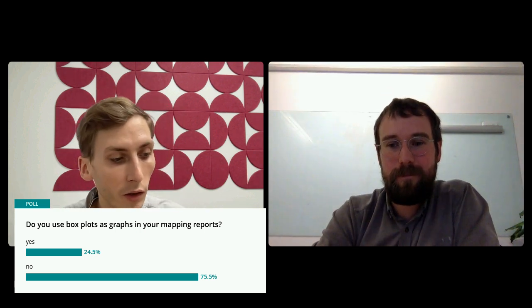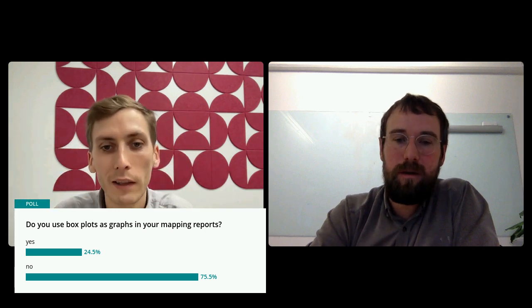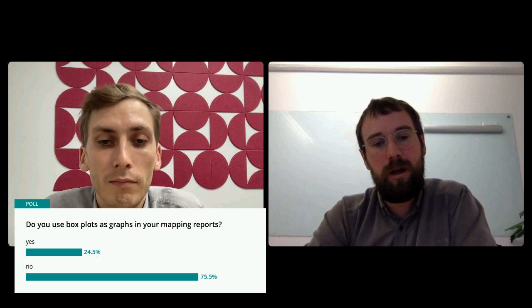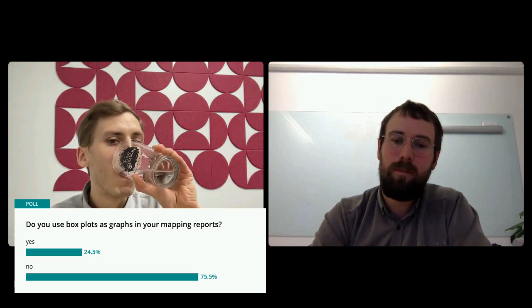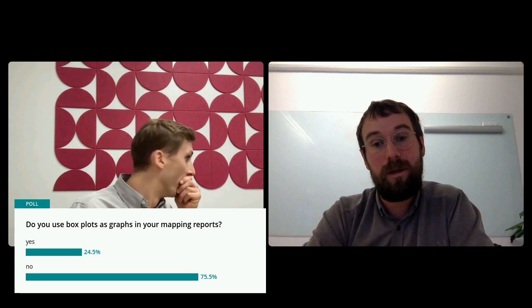Yeah, and something else, when you opt for using software applications from GxP, it's part of the suite that we can visualize. Absolutely, that's also the reason why we've implemented it in our software. It's just such a powerful tool to view data, rather than what I find often is a sort of hunt for the hot and cold spots by single temperature, and it really, in my mind, does not make sense to look at single points of temperature. Especially without even taking into account the calibration uncertainty, then it does not make sense.